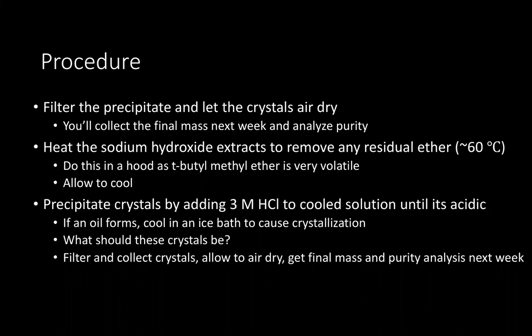If an oil forms when you add your 3 molar hydrochloric acid, cool your solution in an ice bath to cause crystallization. Refer to the flow chart in your lab book and the background information video. Think about what happened to the material in the sodium hydroxide extraction and what the 3 molar HCl could be doing to whatever was extracted. You will again filter and collect your crystals, allow them to air dry, and get a final mass and purity analysis next week.